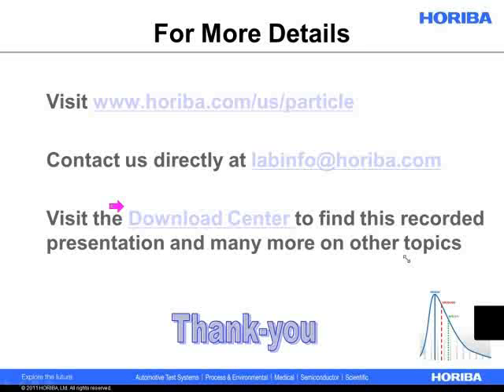But Feng Shao is asking, how can we change the air pressure? If you have the LA950 powder jet accessory, or really any manufacturer's dry powder accessory, there should always be a control. It used to be a hardware dial a long time ago, but now it should all be controlled by software. In the LA950 software, it's just an up and down arrow where you can specify anywhere between no pressure, so 0 bars, and 4 bars pressure, adjustable in 0.1 increments, so 0, 0.1, all the way up to 4.0.